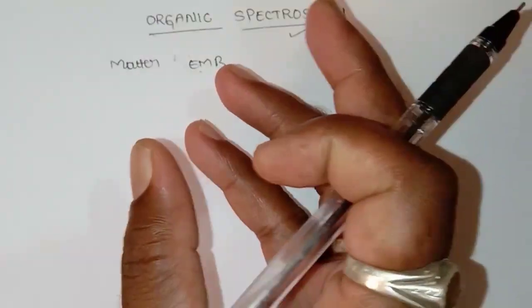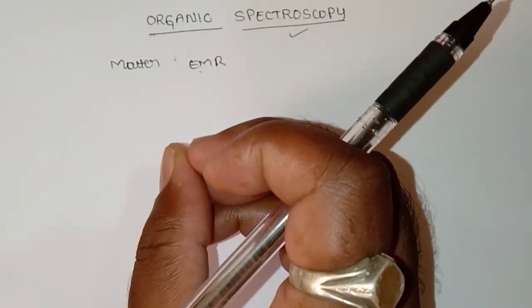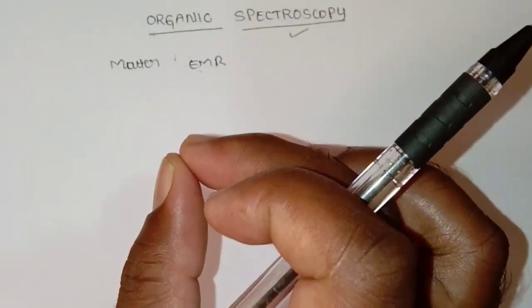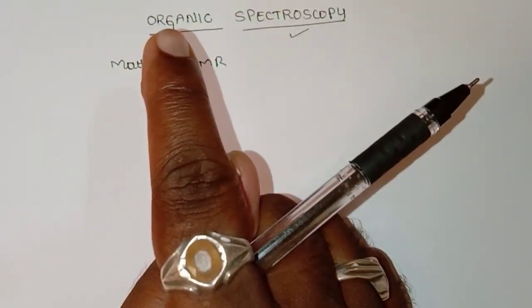And it is believed that the radiant energy which is emitted by the material is mainly because of the fluctuation of electric charge and magnetic field present around the substance.